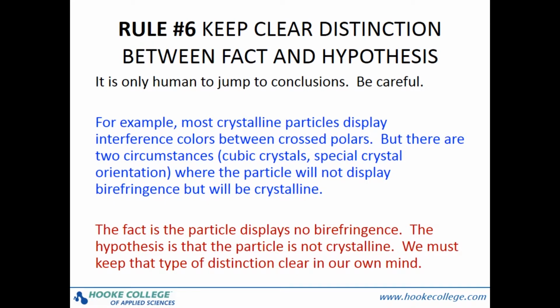Following on from the example in the slide, I once had a contaminant particle that displayed conchoidal fracture and did not have evidence of birefringence under cross polars. Must be glass, right? Nope, no silicon by SEM EDS. It was definitely plastic by our microspectroscopy. Unfortunately, I lost track of this and don't remember what kind of polymer it was.